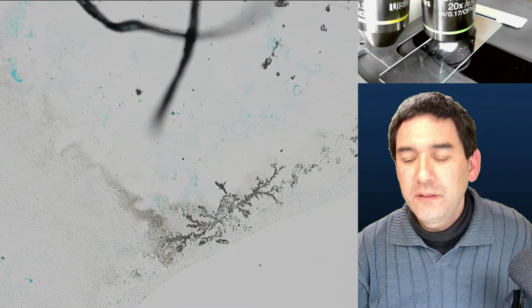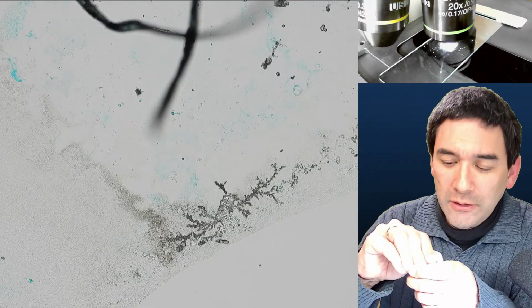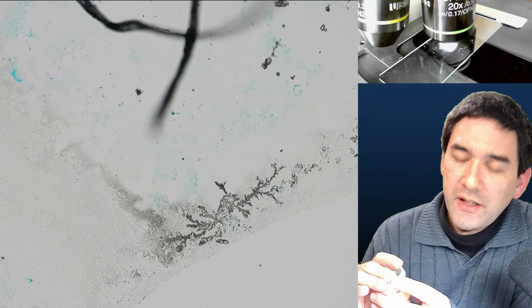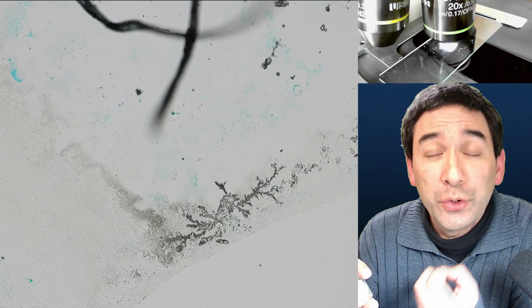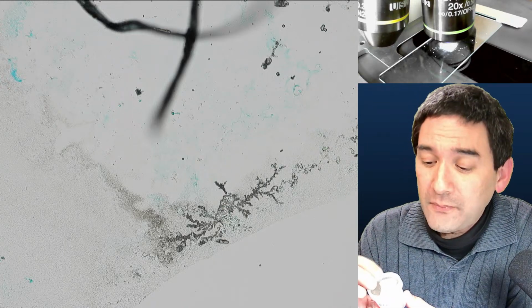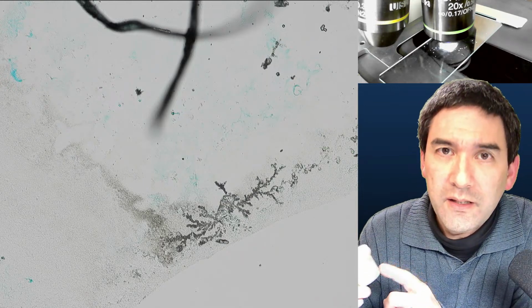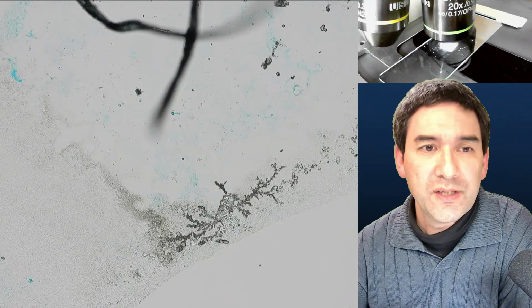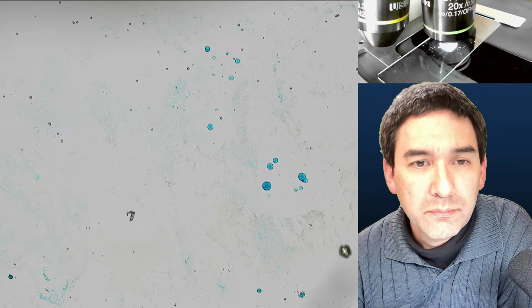So the question was, does it not smell bad at all? No, not at all. It almost smells neutral, because the smell which smells bad, the so-called rotten egg smell, is actually hydrogen sulfide, H2S. But this seems to be pure sulfur. So it's not in the form where it's actually smelling bad. This is not hydrogen sulfide. Oh, what are these blue dots there?